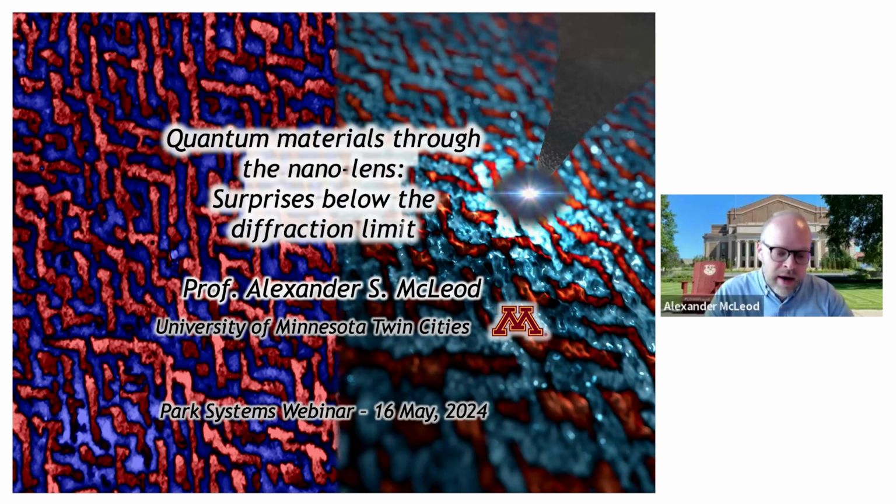And as a consequence of that trick, we're able to see things at the nanoscale, especially in quantum materials, these next generation materials that I'll give you some examples of, that have been impossible to see before. And that makes for a very exciting time to be alive, as it were, in scanning probe microscopy, at the advent of implementing multiple different scanning probe modalities, including this nano-imaging technique, all together to probe the nature of these materials.